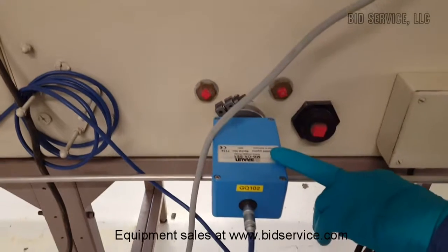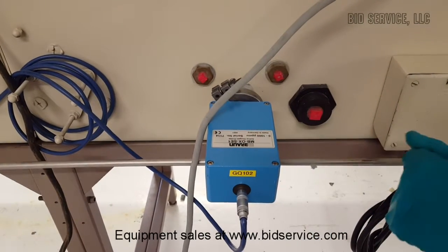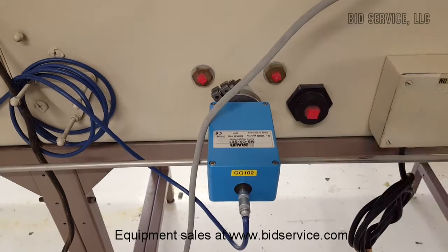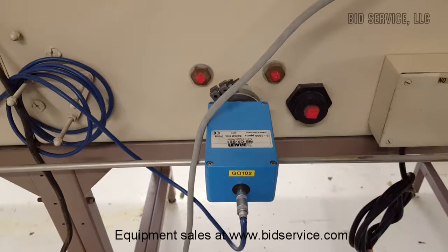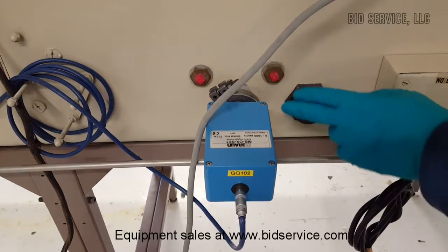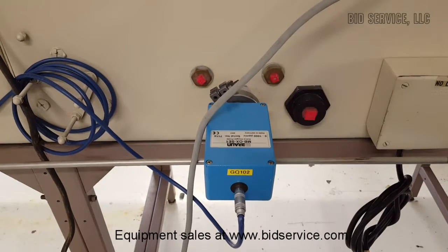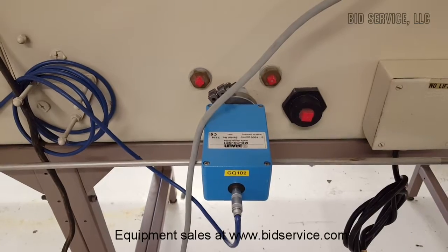Down here you can see we have our oxygen sensor, which is the MBraun MB-OXSE1 — it's just inside the box. This is our house oxygen sensor; we just use that here to qualify the glove box. I'll pull this out prior to shipping and blank it off with a KF40 blank-off.